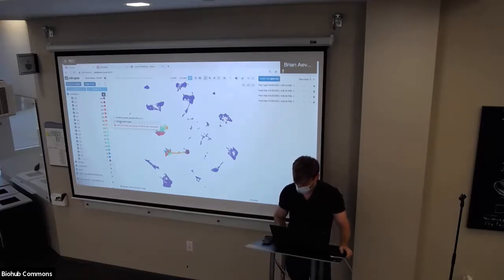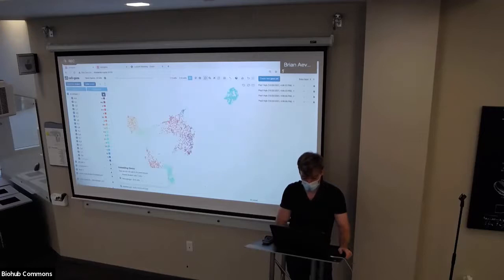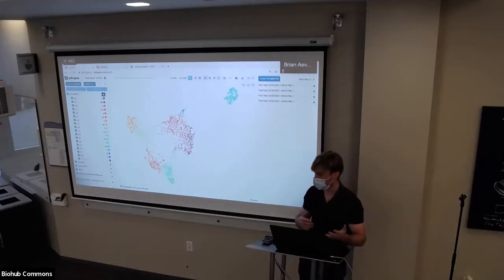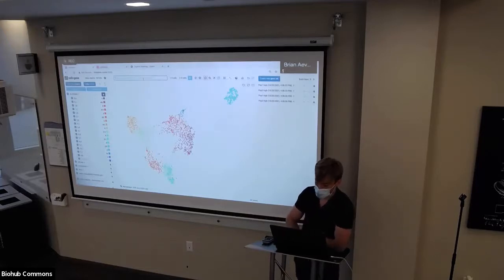And the last thing that I want to highlight is, what if I only care about this particular view of the data? And I'm a biologist who wants to use Tabula sapiens to find structure in this particular subpopulation of macrophages and explore the genes and maybe port it into a Jupyter notebook and do some further analysis. That's where this text box comes into play at the top. You can enter an output file name to save your current view of the data to a file name.